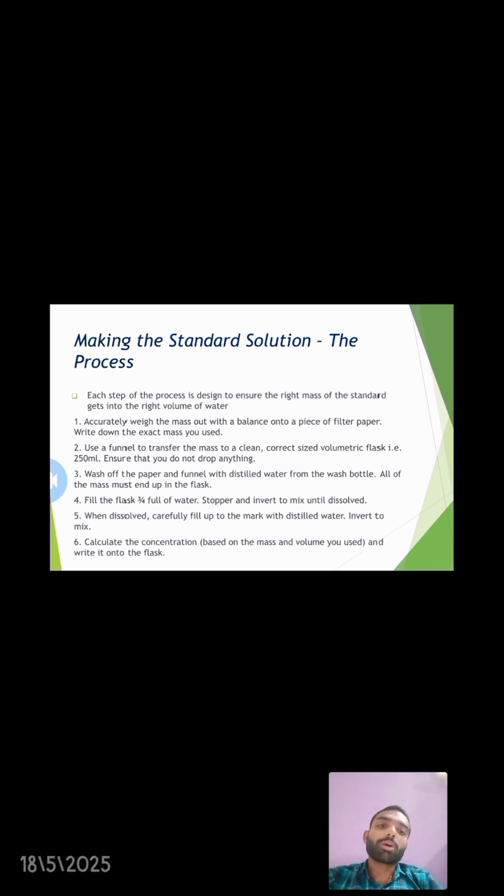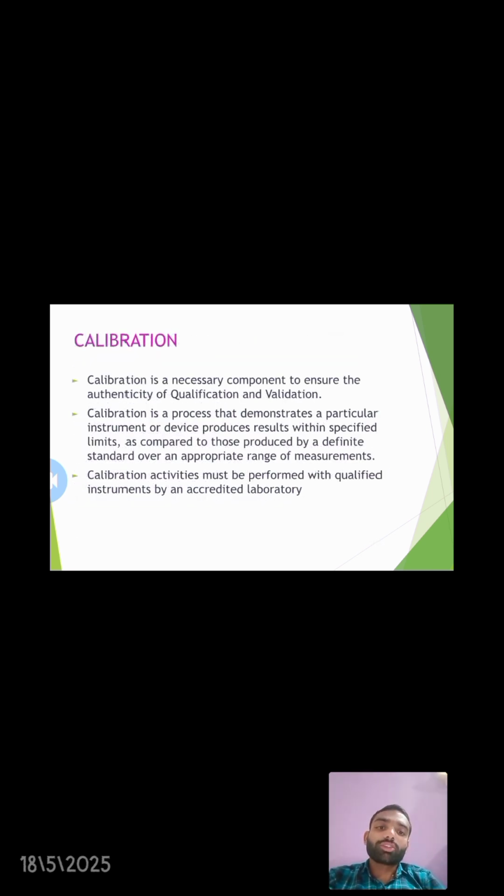Next we discuss calibration. Calibration is a necessary component to ensure the authenticity of qualification and validation.